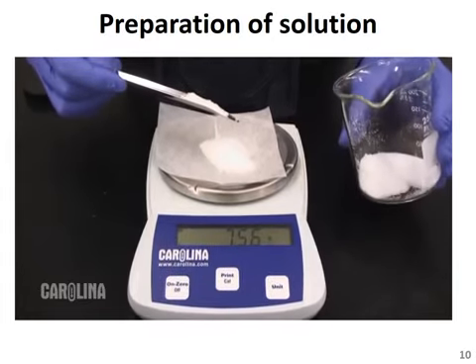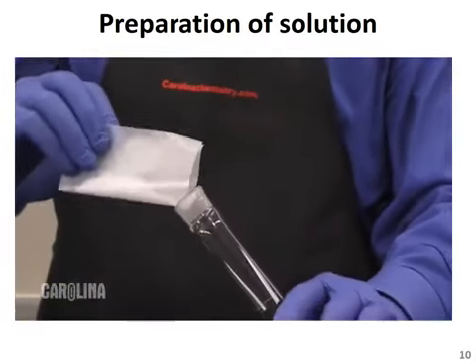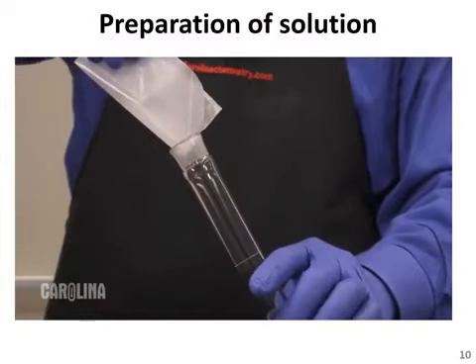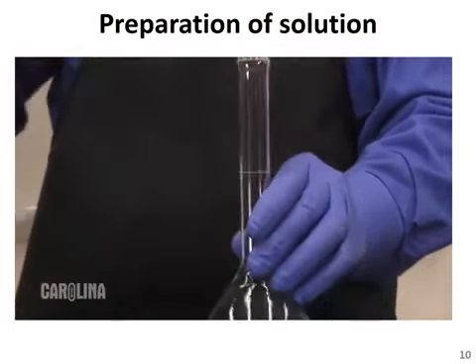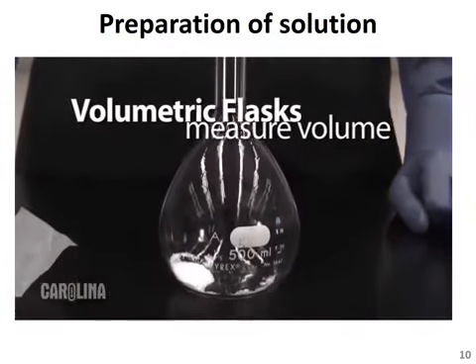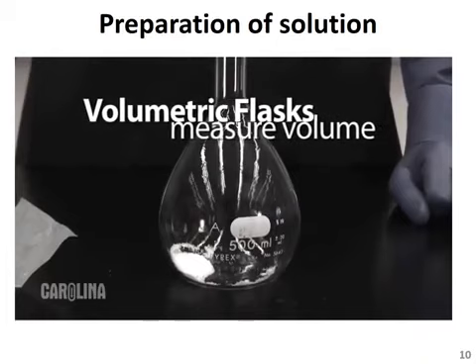Always use an additional container to collect the excess. Once you've measured out your solid and recorded the exact mass, transfer all of the solid to the appropriate sized volumetric flask. Volumetric flasks are made specifically for this purpose and should be used over other less accurate labware, such as beakers, Erlenmeyer flasks, or graduated cylinders.